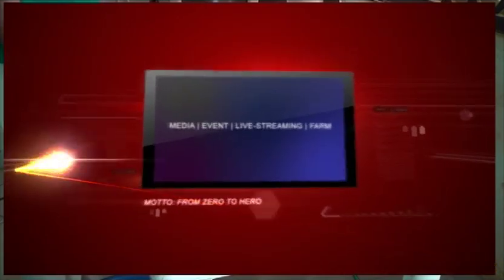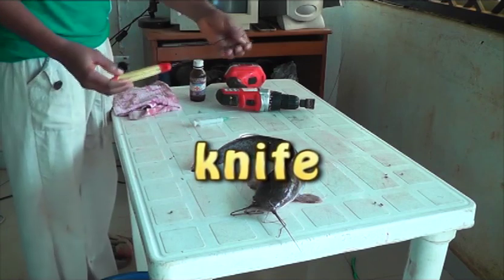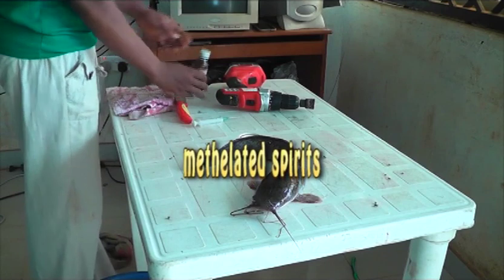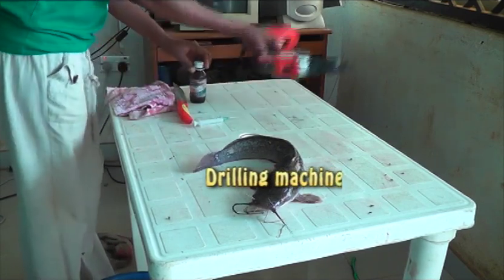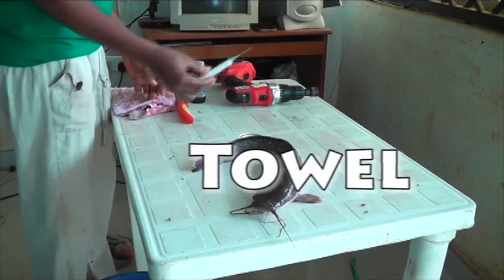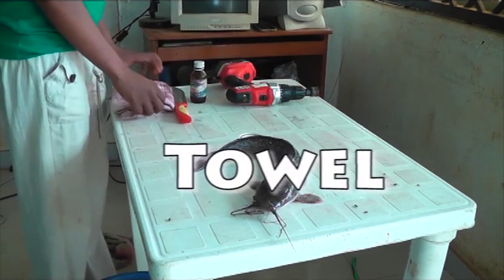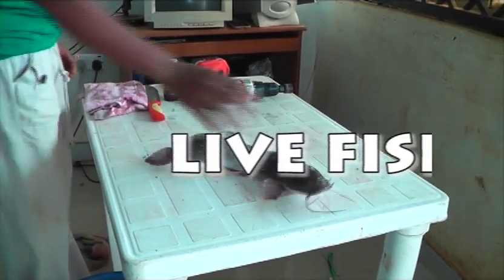The basic tools and materials you need are simply a knife, methylated spirits, a drilling machine, a syringe, a towel, and most importantly a living fish, just as you can see on the table.